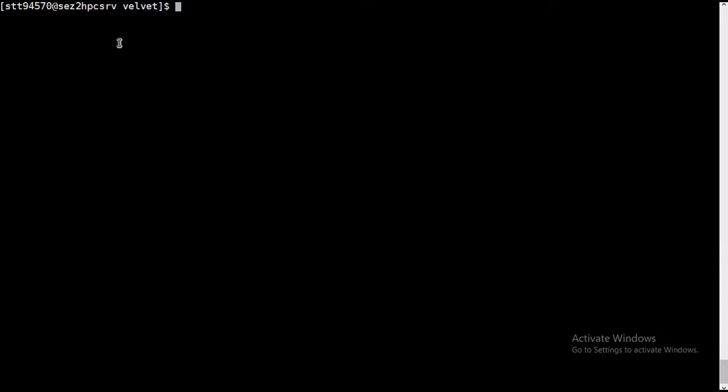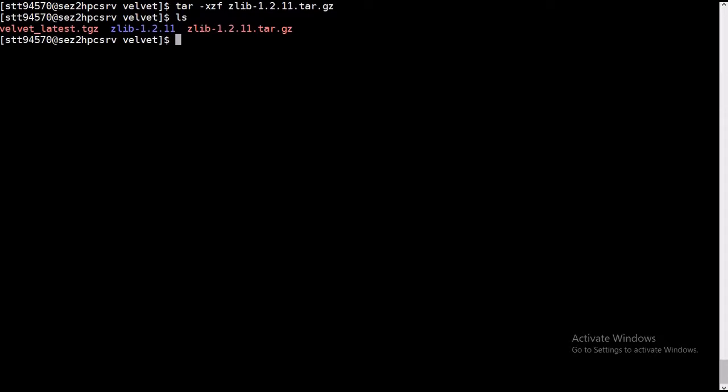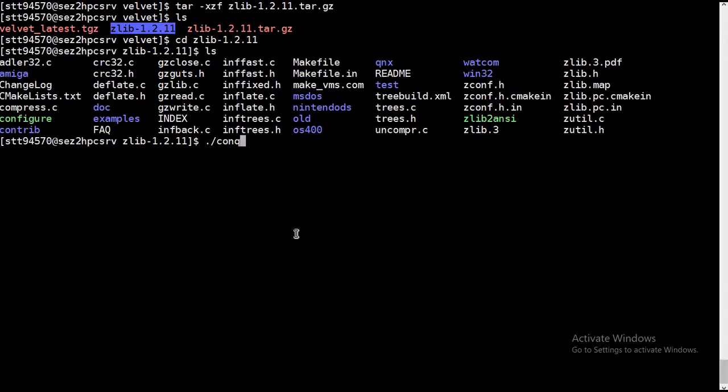Install first we need to untar that, and here it's untarred. So we go inside that directory.